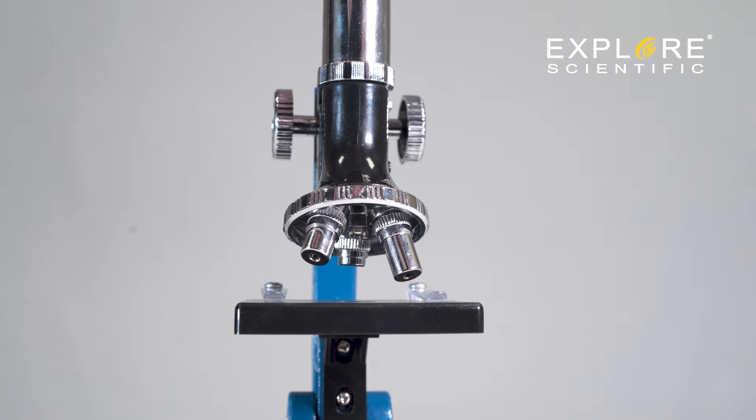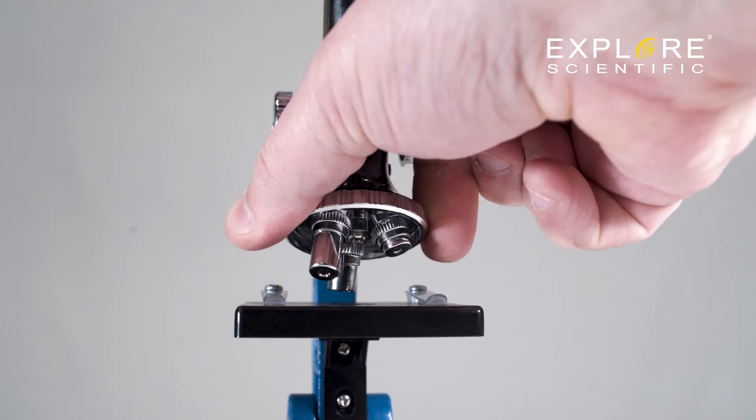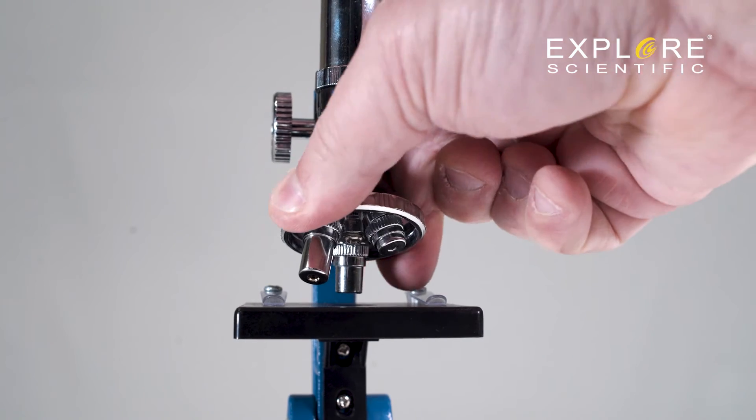The turret holds three lenses with the smallest lens being the least powerful. The turret should easily turn, allowing for higher and lower magnification lenses to be positioned over the specimen.